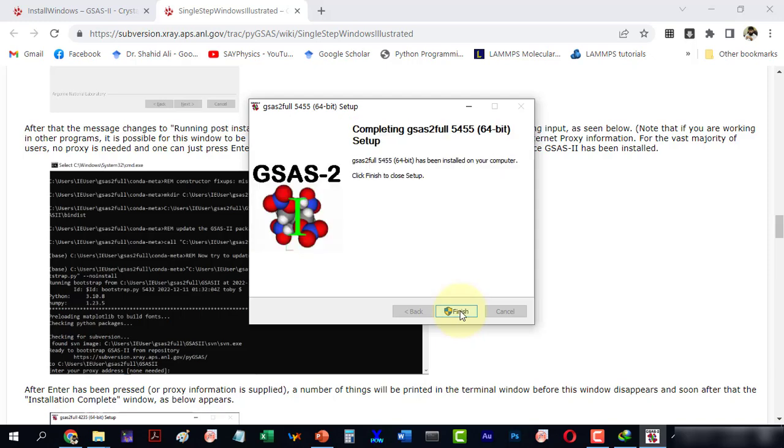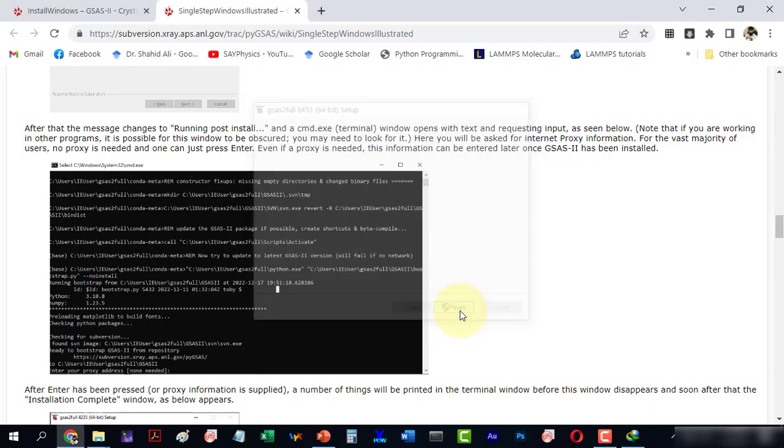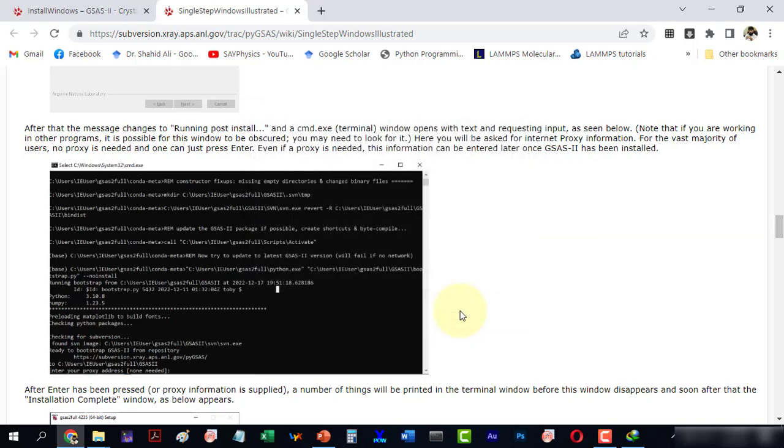Click finish. Now the software is installed.